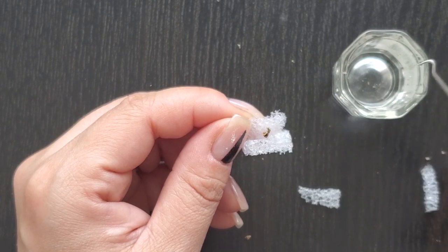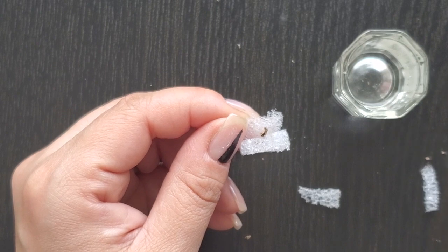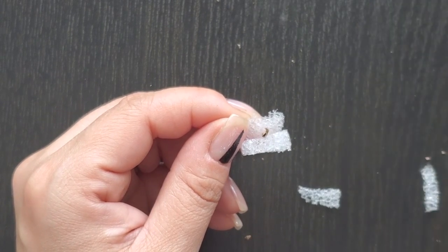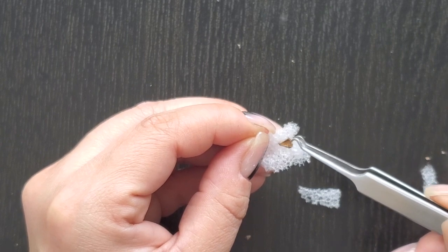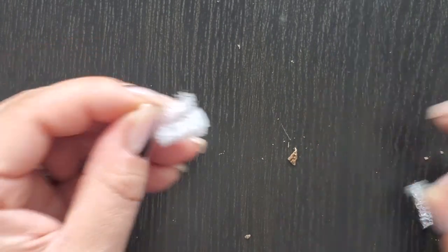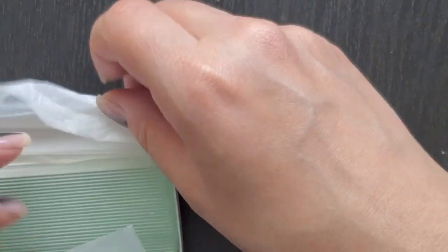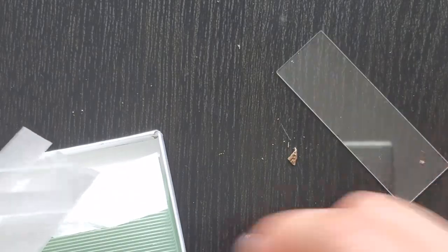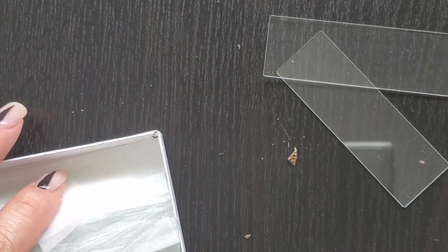And then what you would do is, if you have your section, usually it's attached to the Styrofoam, you'd place it in alcohol and it would separate, and then you could take your piece out and hydrate it on the slide. I'm not going to do that. I'm just going to go right into method number 2, which is my favorite way of working. Also because you don't have to have Styrofoam. And it's with tools that you already have. You're basically going to use two slides.